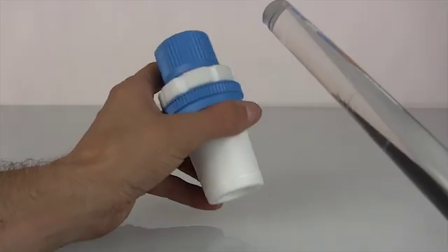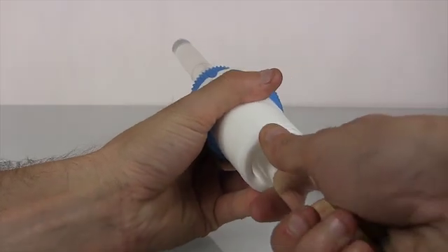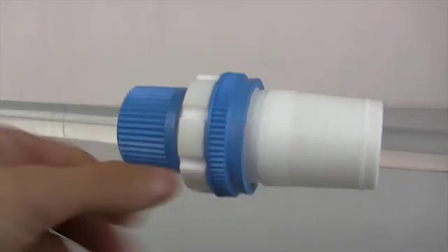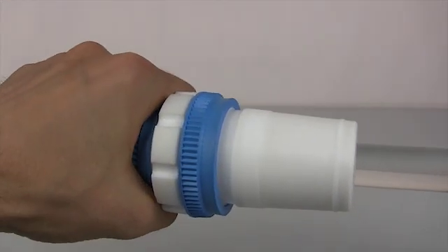Now let's look at how the bearing holds up as we insert a stir shaft into the bearing. Each bearing is matched to a specific stir shaft diameter. Look as we move the stir shaft through the bearing.